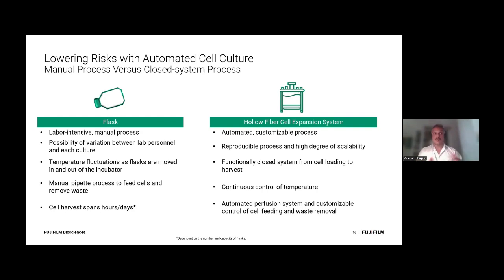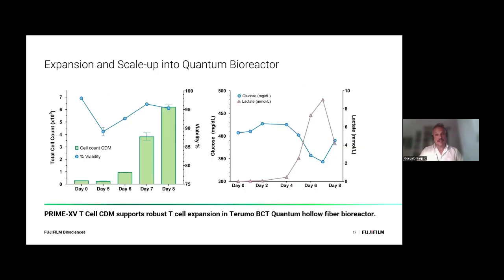Let's say if you want to do stir tank bioreactors in the later stage, perhaps don't start with a flask in a small scale, but start with shaker flasks, or with a small scale bioreactor. Now there's plenty of small scale stir tank bioreactors. There's right now extremely different options to do that. So take in consideration, think ahead, and even if you do small scale and not really fully automated, start thinking, how am I then going to translate that into my platform of choice later down the line?